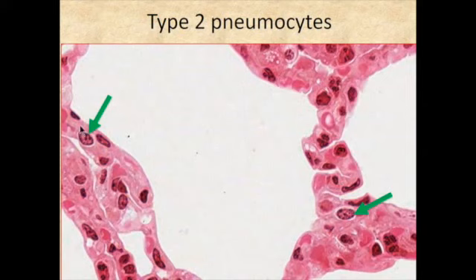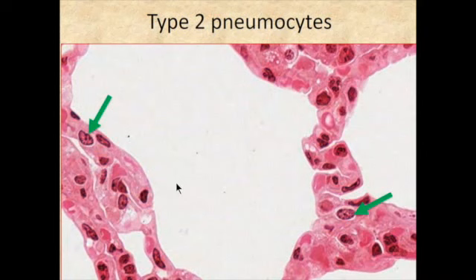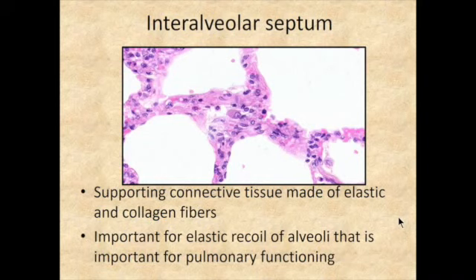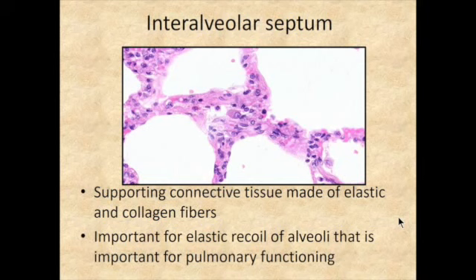Here you can see a couple of type 2 pneumocytes pointed out. A type 2 pneumocyte is sometimes easier to find if it has a nucleolus in the nucleus. The septa between the alveolar spaces are going to have not only collagen fibers, but also elastic fibers and reticular fibers. The elastic fibers are very important for the recoil that occurs in the alveolar spaces and for pulmonary functioning — this becomes apparent when talking about conditions like emphysema.